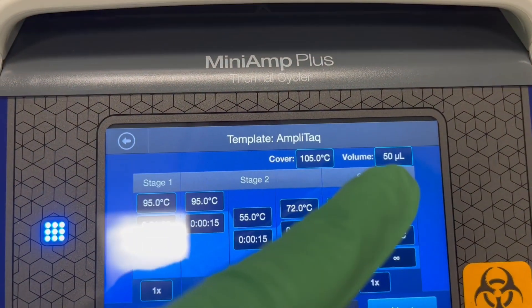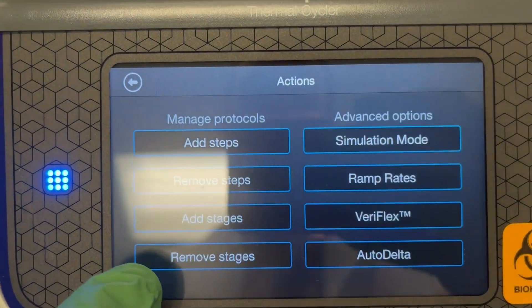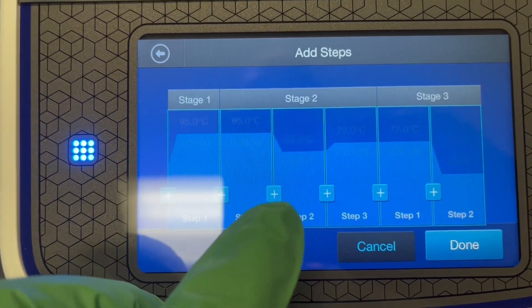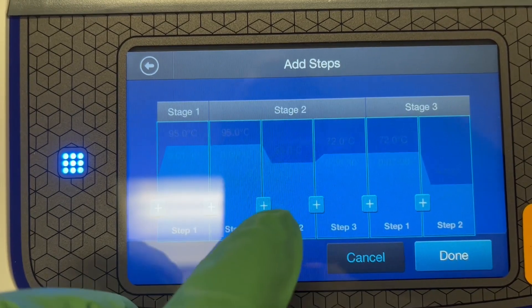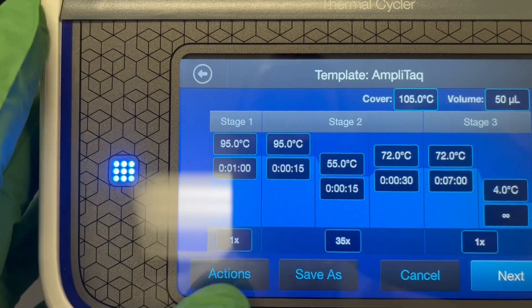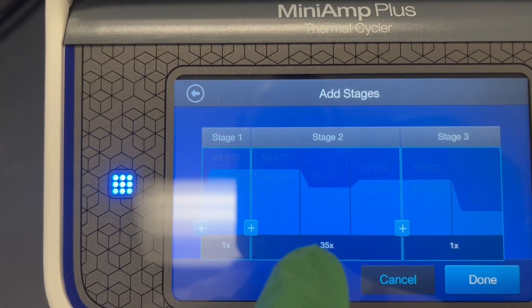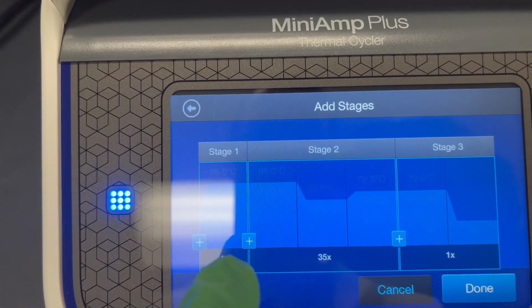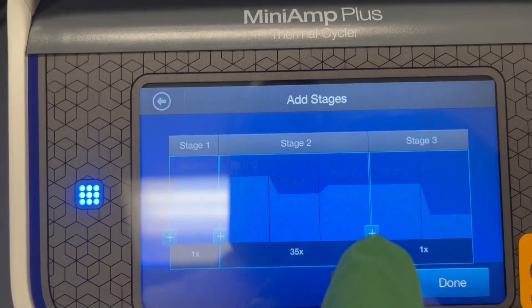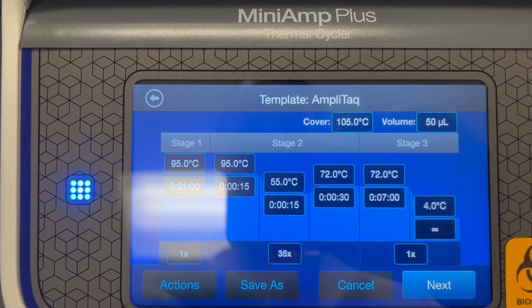You can also set your reaction volume in the upper right-hand corner, and there are some advanced options. If we hit Actions we can add steps — hitting the plus on either side of a given step will add another step where you can set the temperature and time. We can also add stages, which are the big gradations. So if this stage repeats once and this one 35 times, we can hit the plus to add another stage with a different number of repetitions and a different set of steps.